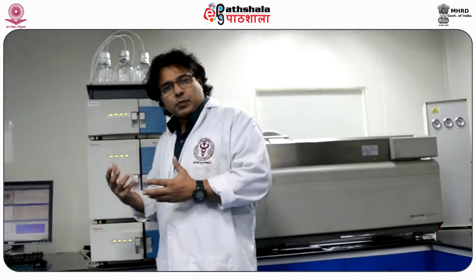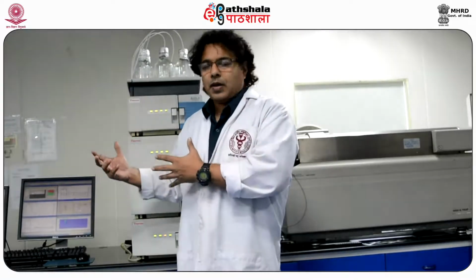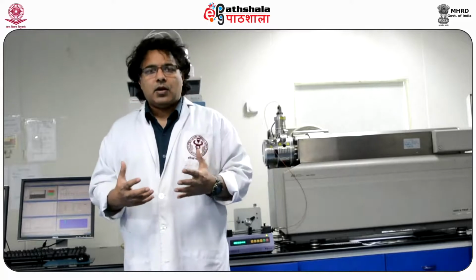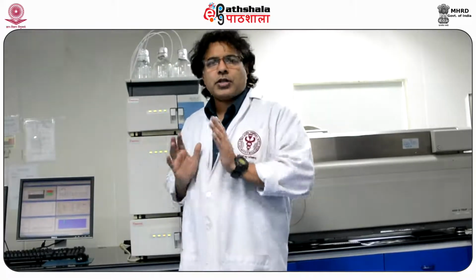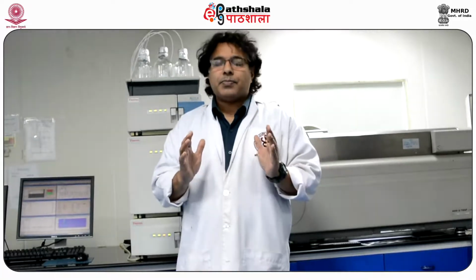Now, let me try to explain how we control this and what type of information we get from this machine. How are we trying to analyze it? To be more precise, I'm going to explain how this instrument identifies homatropine. Today we are going to spray homatropine to show you how this separation takes place.